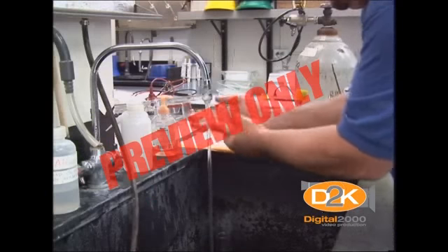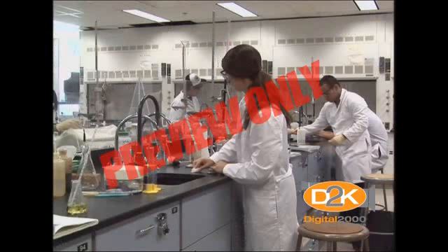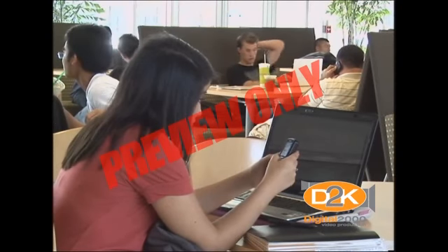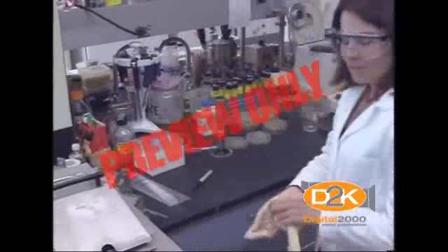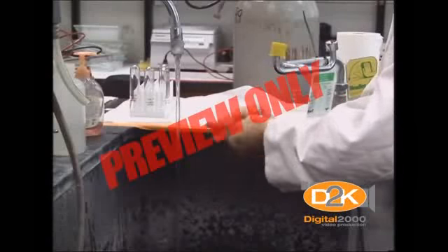All laboratories are required to have a fully functional sink with a drain and pressurized water. No chemicals should be dumped or disposed of in the sink. Lunchrooms, break rooms, and restrooms must be separate from laboratory areas. You should remove all personal protective equipment before exiting the laboratory and should wash your hands before entering other areas.